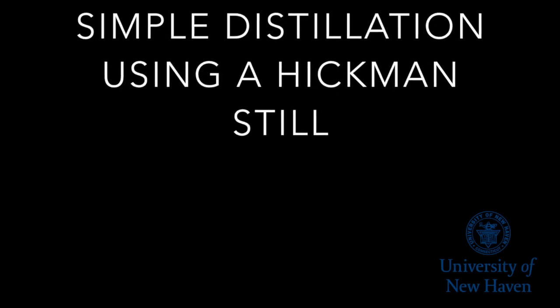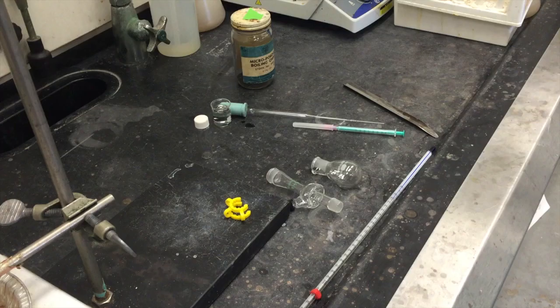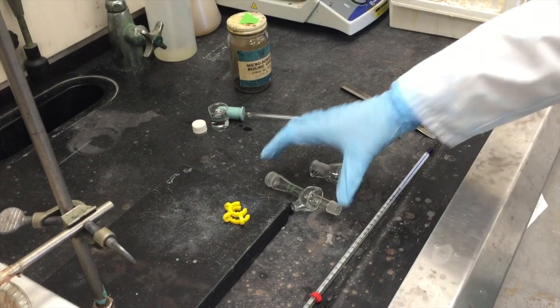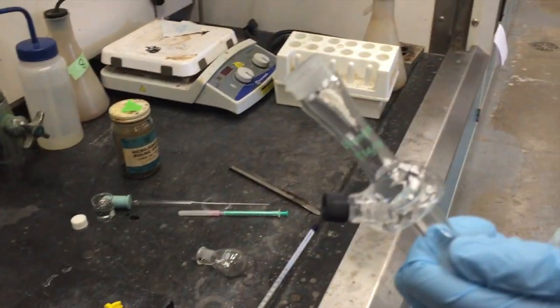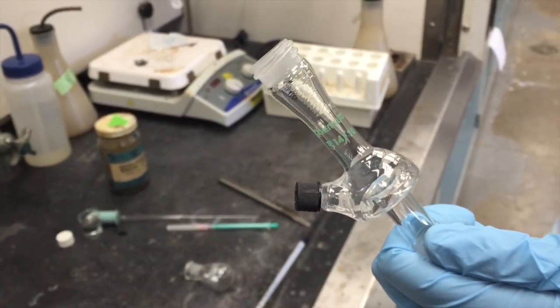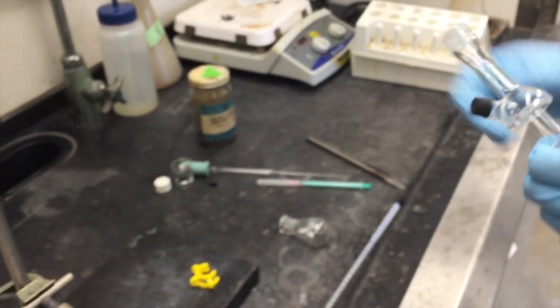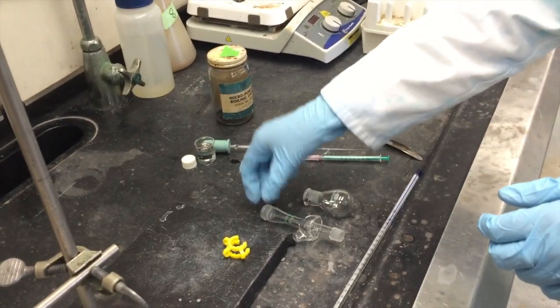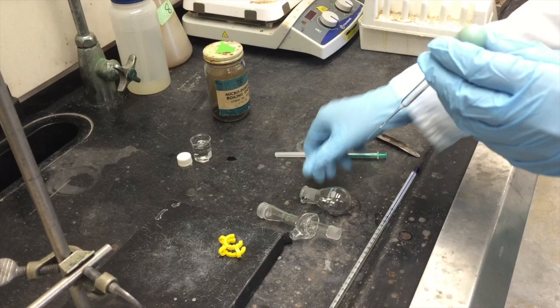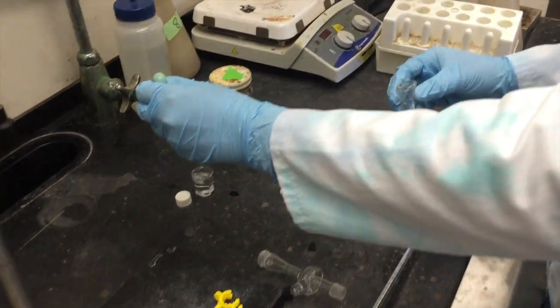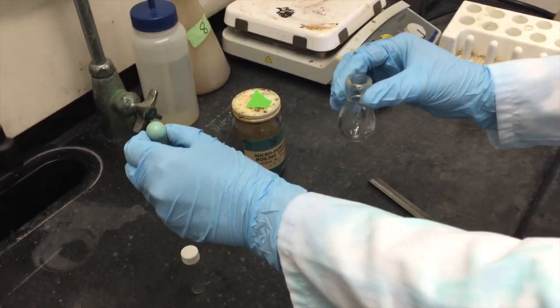In this video you will learn how to perform a simple distillation using a Hickman still. A Hickman still is this piece of apparatus. Begin by transferring your desired amount of liquid to a round bottom flask and adding a boiling chip.